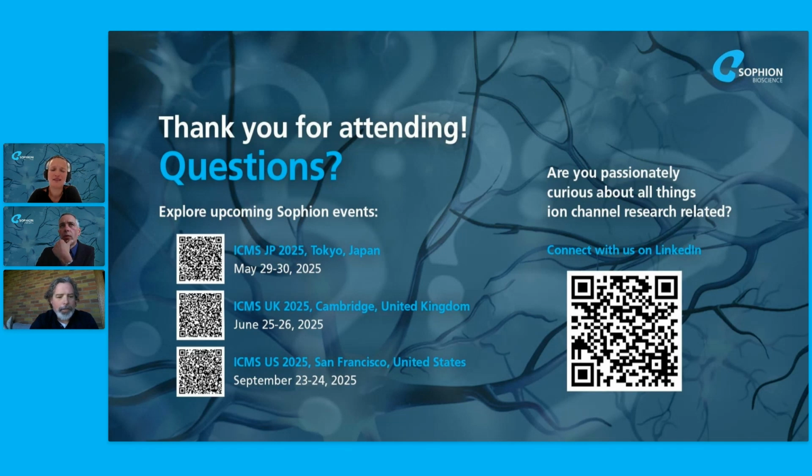Can I maybe jump in here too to add a little bit? Yeah, so we do have our iCell sensory neurons, which are iPSC-derived sensory neurons, and we've done quite a bit of characterization of them, kind of outside electrophysiology, mostly testing for function of mechanosensation or nociception using calcium assays, and we can add those agonists for mechanosensation and nociceptors, and we see increased calcium. So we have done a little bit of that on our cells, and happy to share that with you, Adele, if you want to connect with me after the webinar.